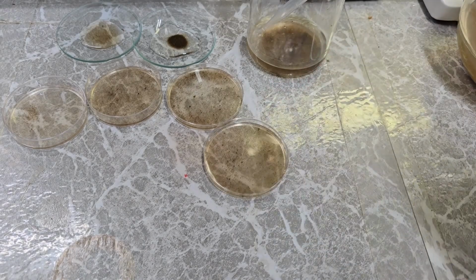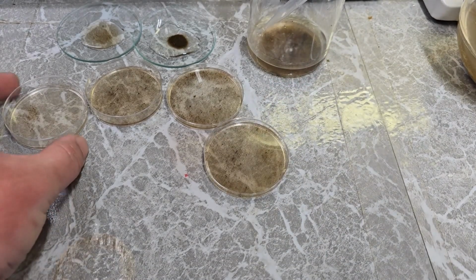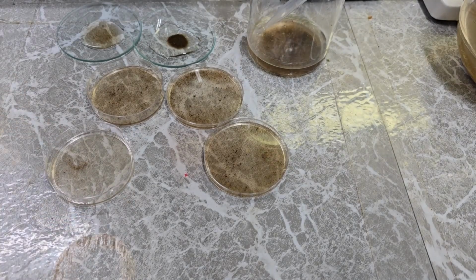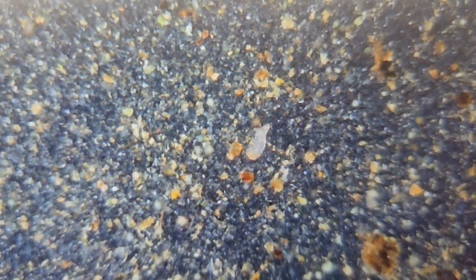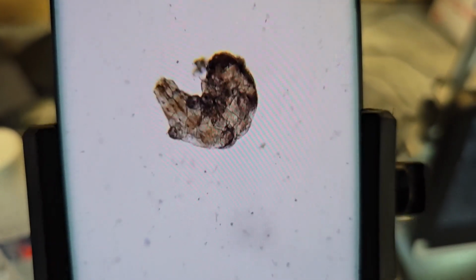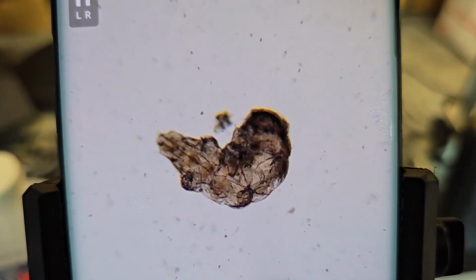There we go. All right, now I'm going to take these and look at them underneath my microscope over here and see what we can find. Tardigrade, I found one. Hey, there he is. Hi, little guy. There he is underneath my compound microscope. Look how cute he is.